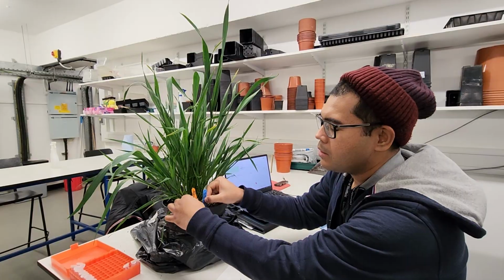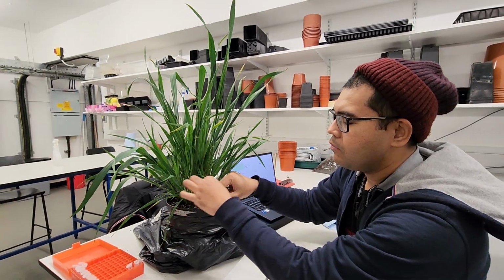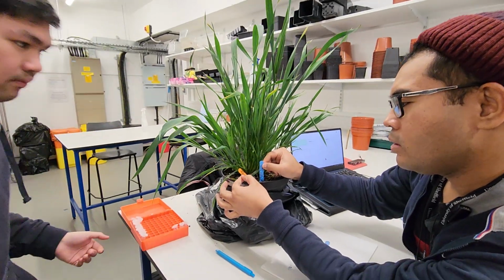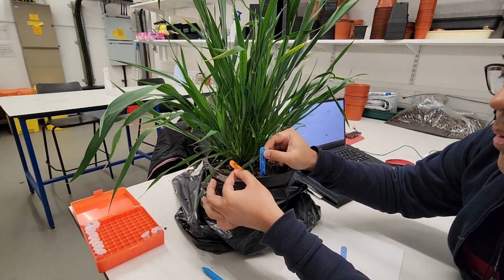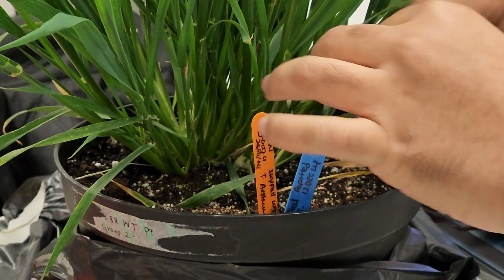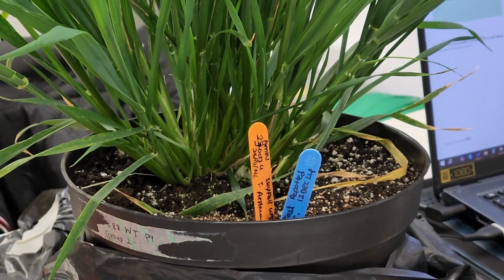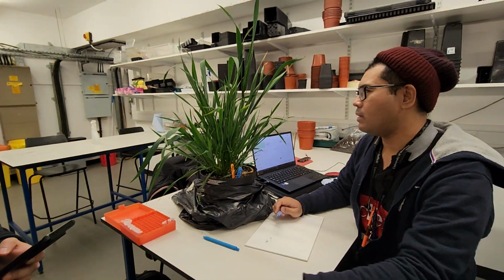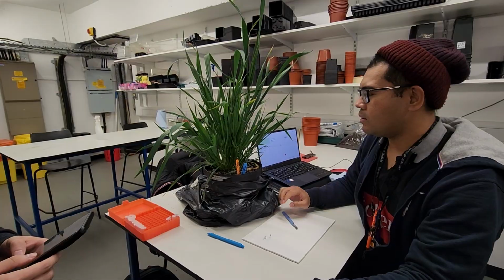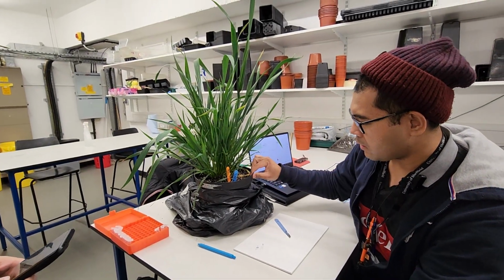So this wheat actually has been in the vernalization chamber since, when is it? 27th of October. So how many months now? 4 months. Yeah, it's been in that chamber at 6 degrees, 8 hours light, 16 hours dark for 4 months. Now we just transfer it to the regular chamber.